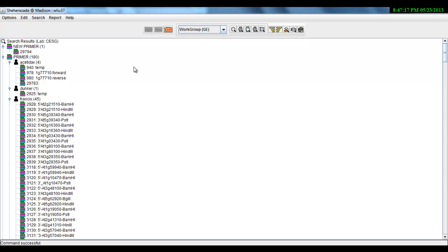All primer records created by a lab can be searched by primer name, owner, Sesame ID, and many other criteria. The two most common searches are by owner and by ID. If you want to find a primer record created by any member of the lab, use the by owner search option. You would want to search by ID if, for example, you know that all primers related to the enzyme pancreatic elastase have names that include ELA for elastase, and you are interested in finding a related primer.